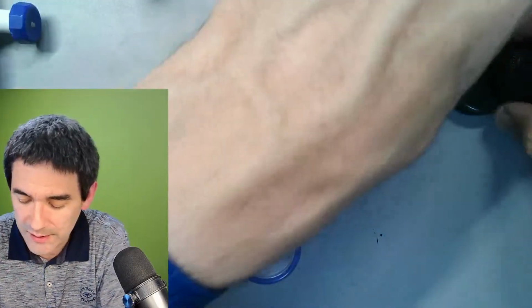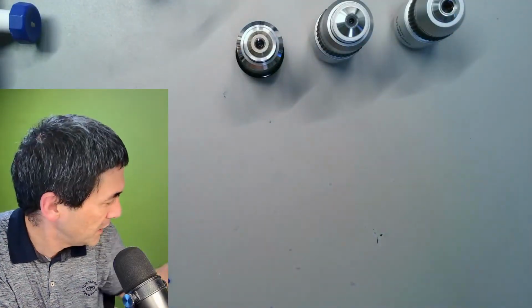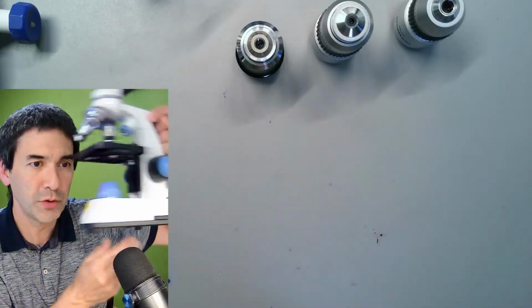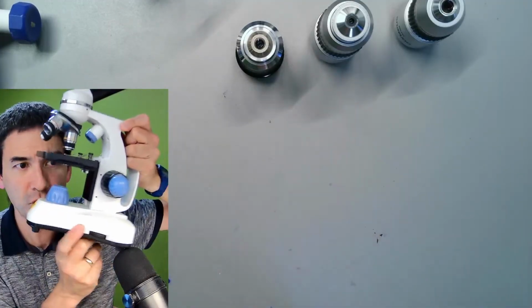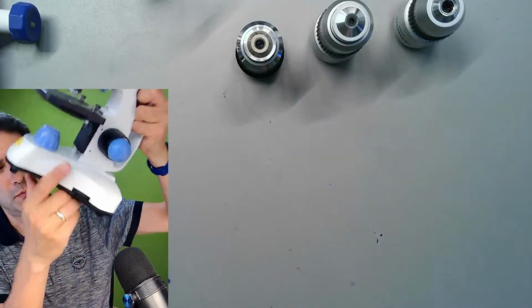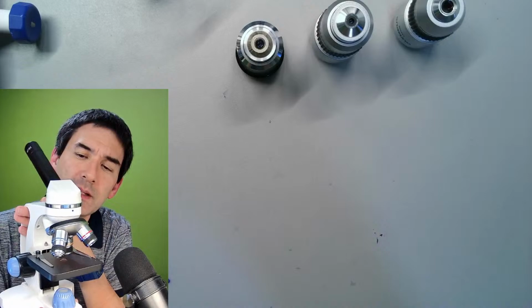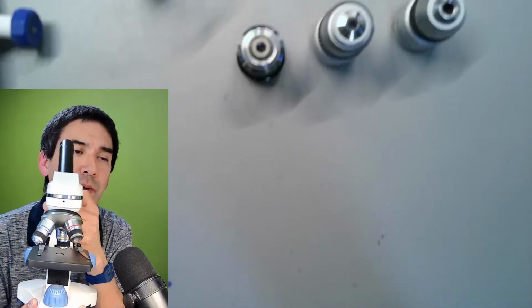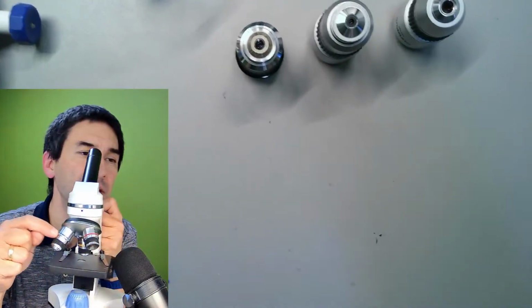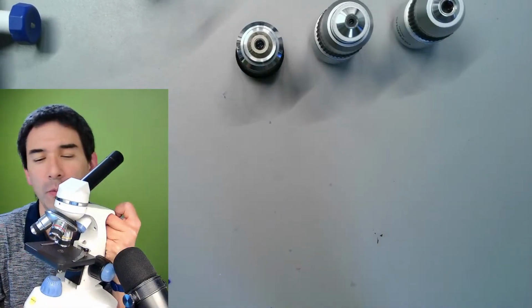Okay, and there is another microscope I want to show you. There's a reason why I look at this. Maybe I show it to you. It's an introductory microscope, a Swift. I forgot the number. I think it's Swift SW150. It's a slightly better one of those introductory ones, because the optics are a little bit larger than the others, and I would like to actually talk about those optics here.